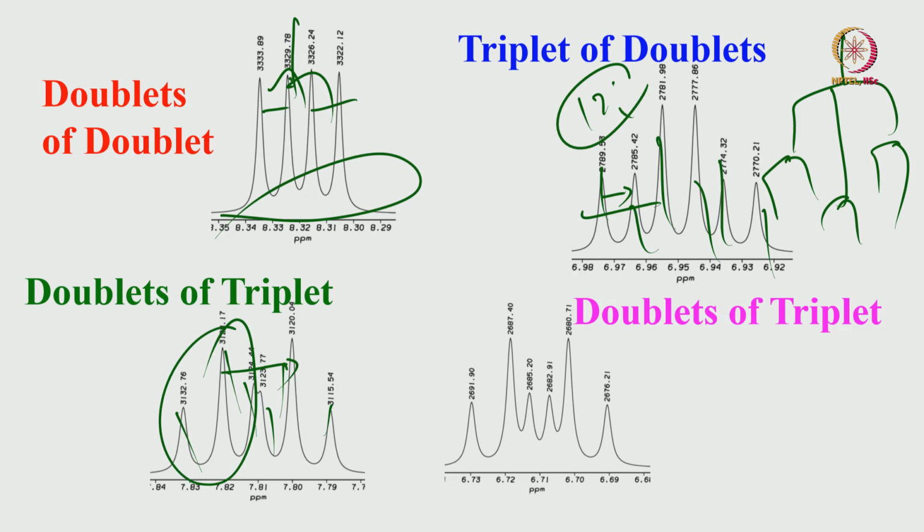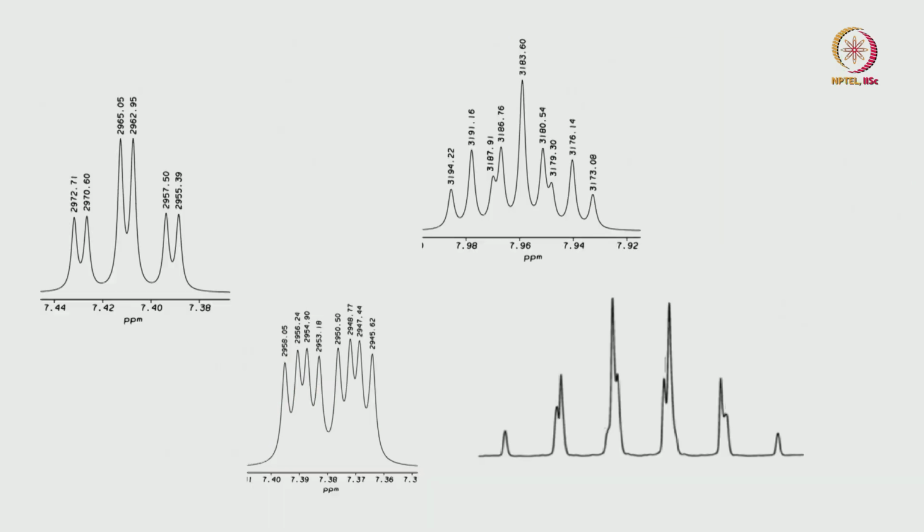What about this one? Again identical to this. This is also doublets of triplet. Okay. What about this pattern? It is a very interesting real spectrum of a molecule.